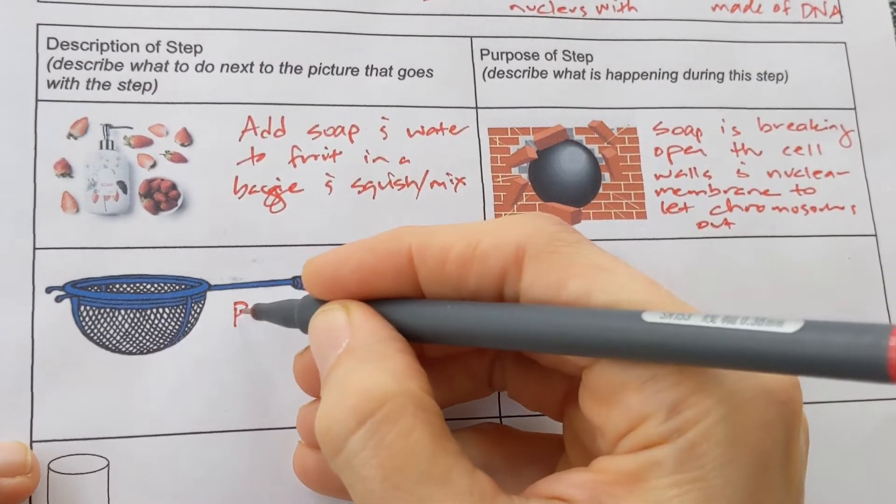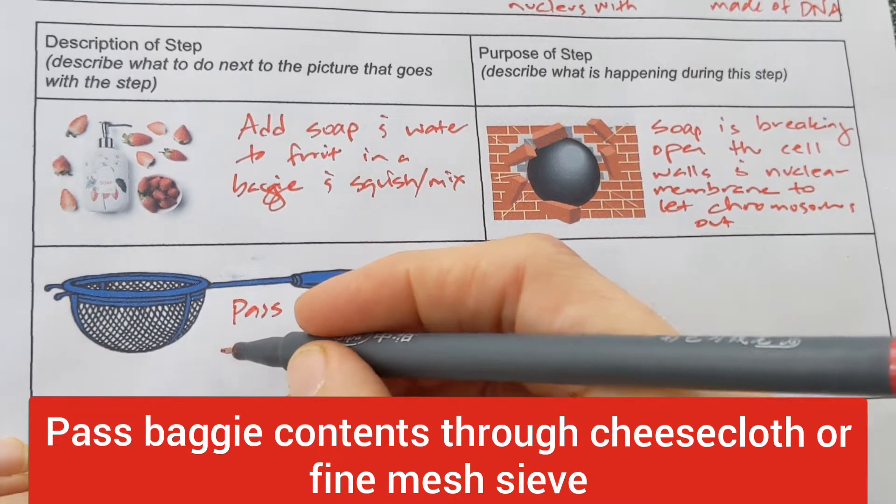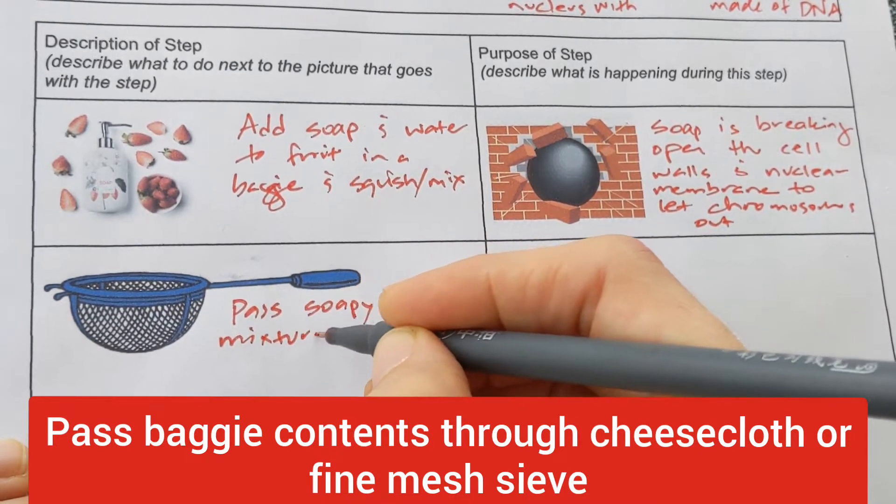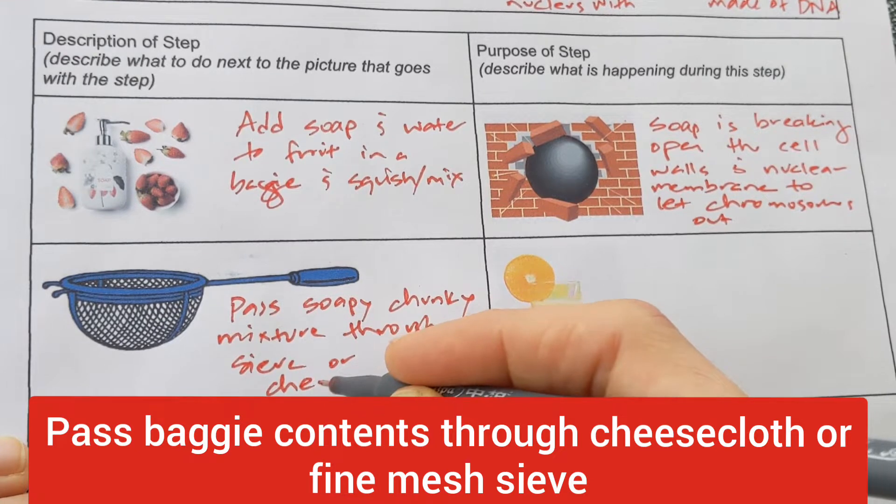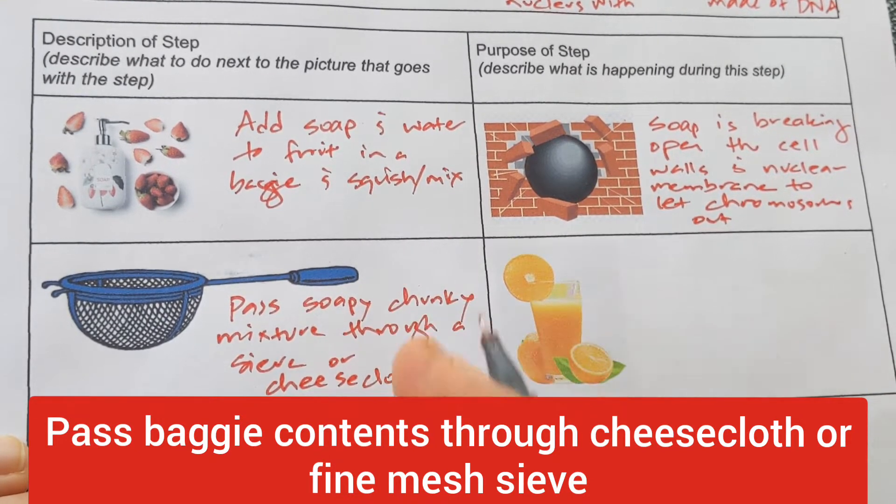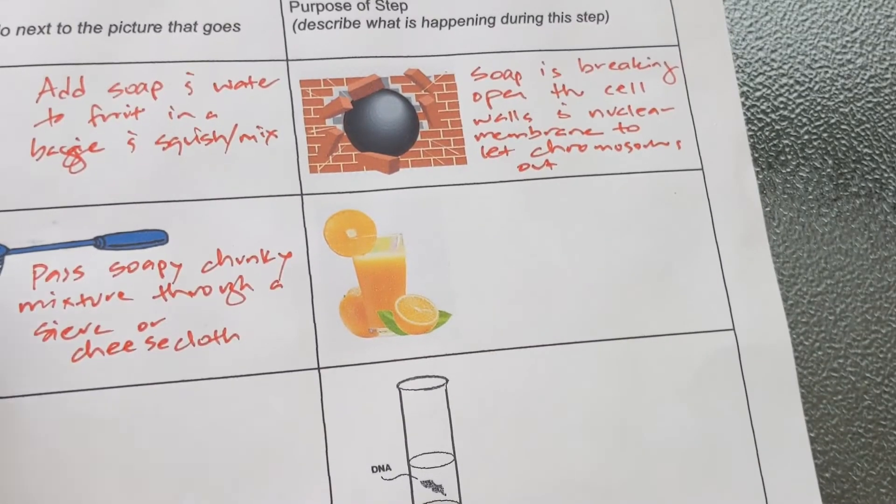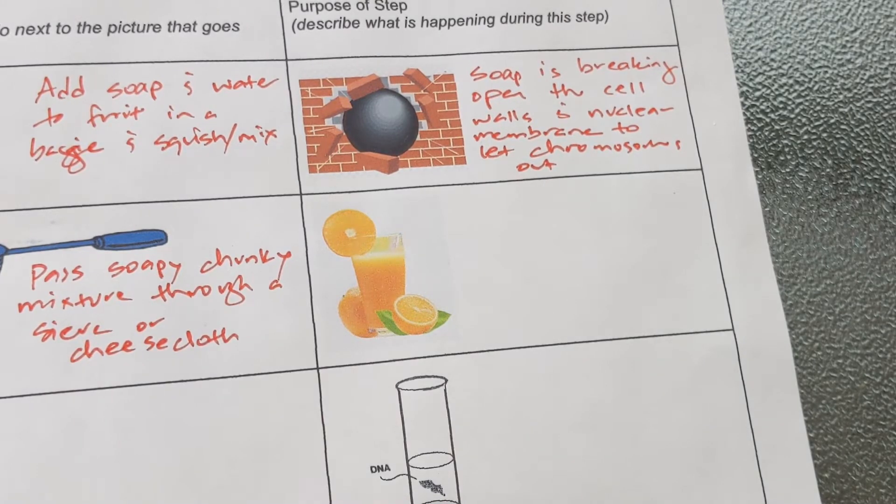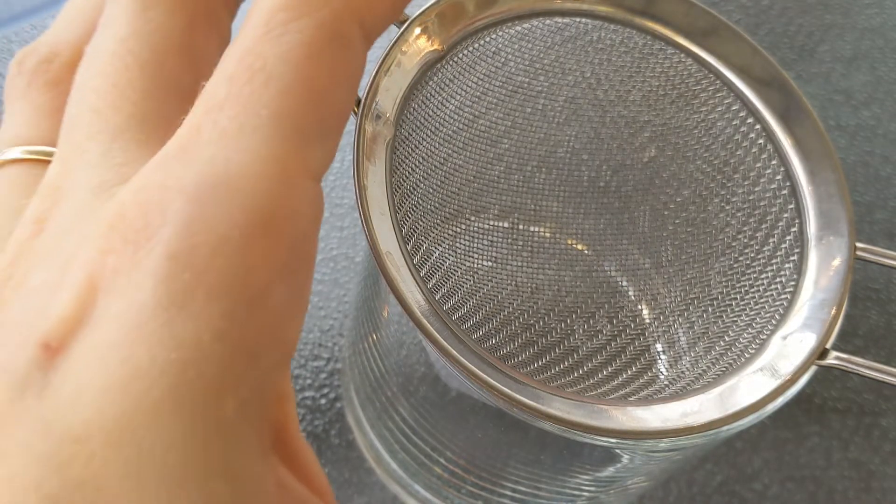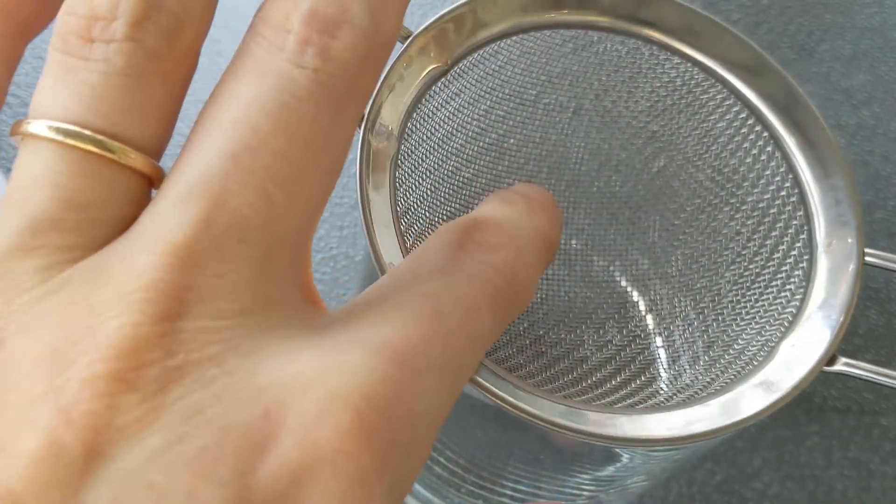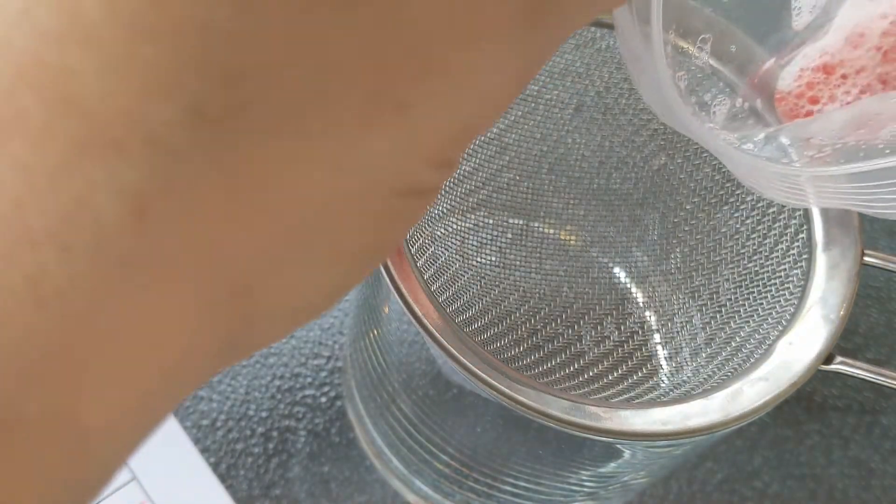The next step is to pass the soapy, chunky mixture through a sieve or cheesecloth. Cheesecloth is really nice if you happen to have it around. But since it's not like 1805, I don't really keep it at my house because I don't make cheese. And a sieve will work just fine. But if you're in the classroom, you're probably able to use cheesecloth. This can be a little bit messy. You're probably going to get a little bit on your fingers. If you're using cheesecloth, it's good to let it dip down in your cup like this, put it in, let it dip down, and then use a rubber band to secure it to the glass or the beaker. You're probably using a beaker if you're in a science classroom.